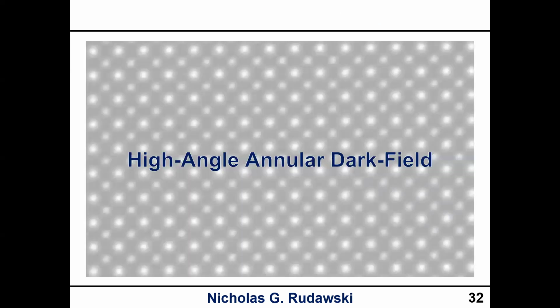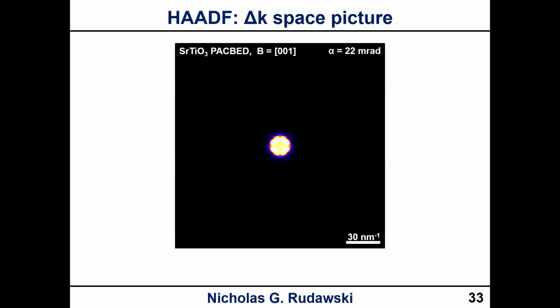So with that in mind, we're going to talk about what is easily the most popular and still most important STEM mode, which is HAADF. We're going to look at each of these STEM modes from the delta K space or diffraction picture. Here we have a simulated pattern of strontium titanate along 001 with a fairly large value of alpha, like we would use for CS-corrected STEM.